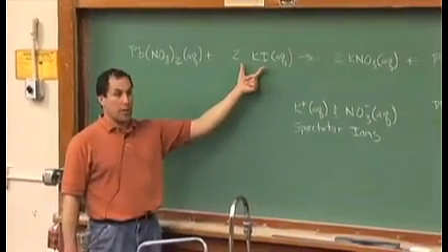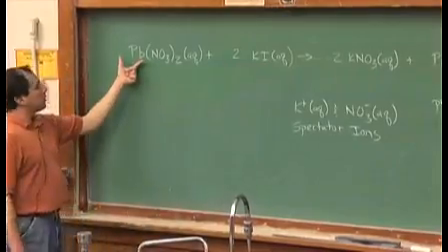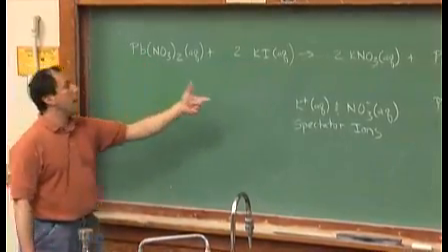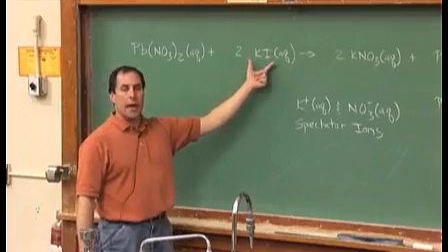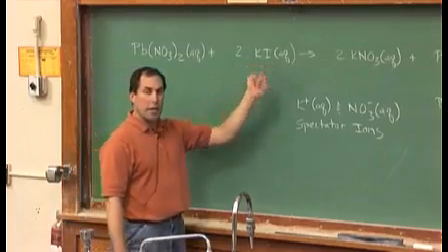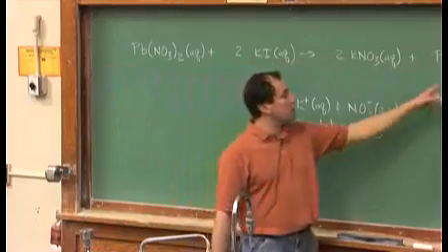They'll continue to float around in the solution, but the lead two plus and the I minus will get together and make a precipitate, a solid, the yellow solid that goes down to the bottom of the beaker.